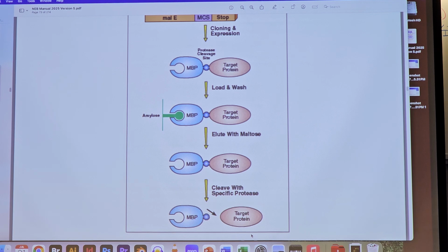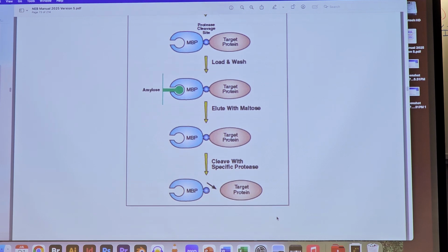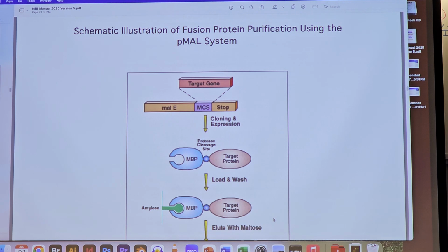Yes. So the cut site, and then they add a little more codon at the end. Right. Exactly. Yeah, I'm going to show that again. So let's back up to the previous diagram again.